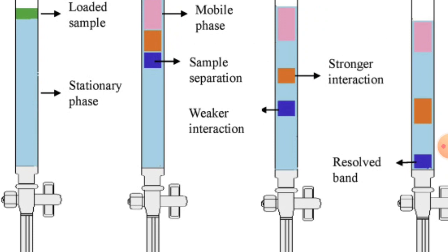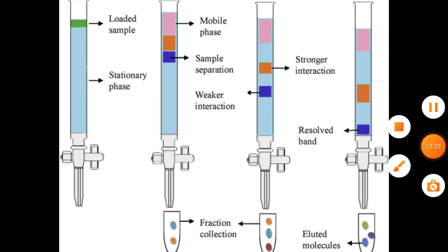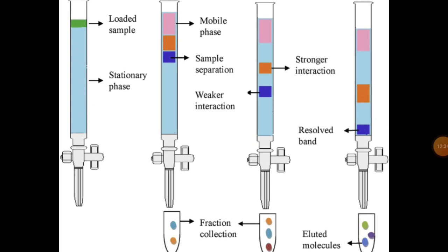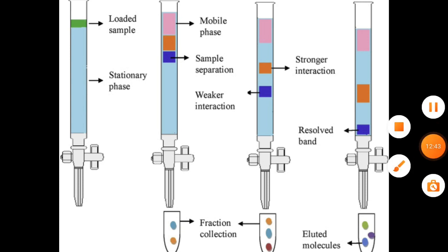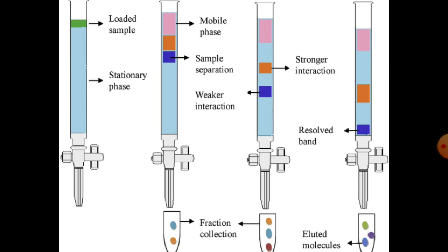column chromatography. As you can see, it is the best method for purifying protein, okay. Purification for research purposes is often done with the help of this method, and it gives you the choice to use a wide variety of mobile phases. That is an exciting thing, but it has some disadvantages too.